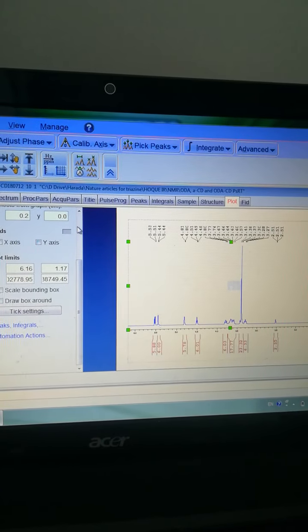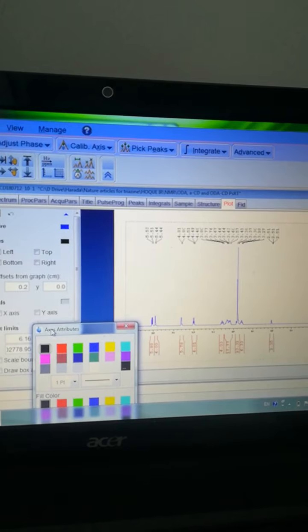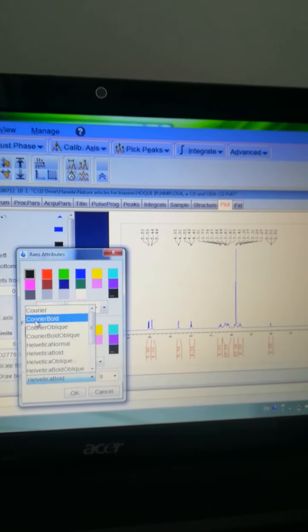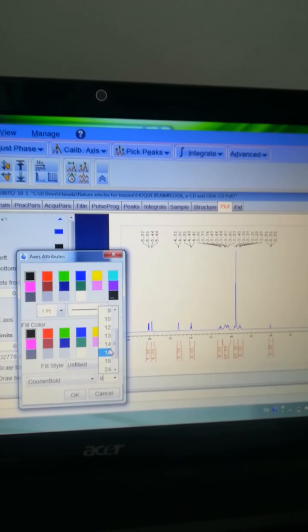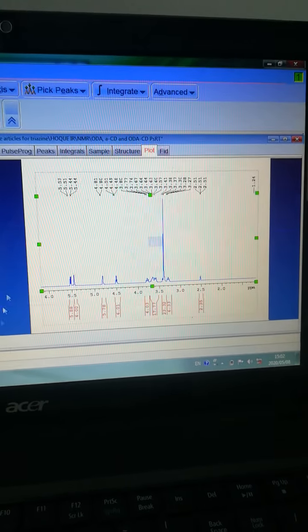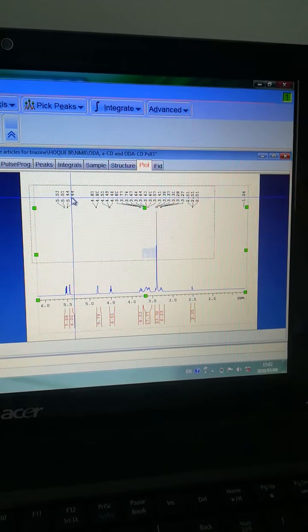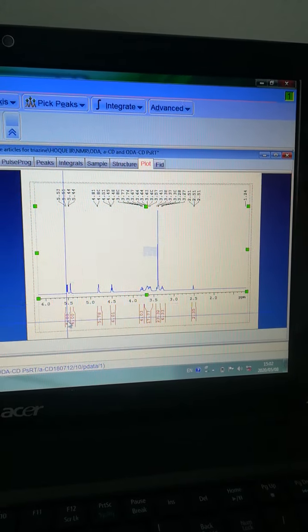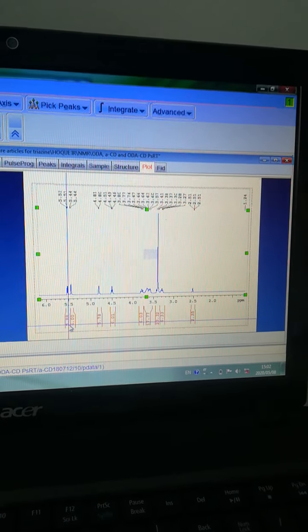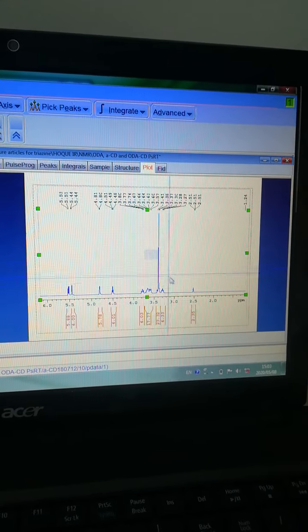So we can expand the axis values as well. In the same way, just click here, choose Courier bold, and now 16. Now you can see almost everything is identical. The values I expanded, and also the scale, and everything has now appeared well. So now this is prepared for publication or to put in your manuscript. It is quite good to see.